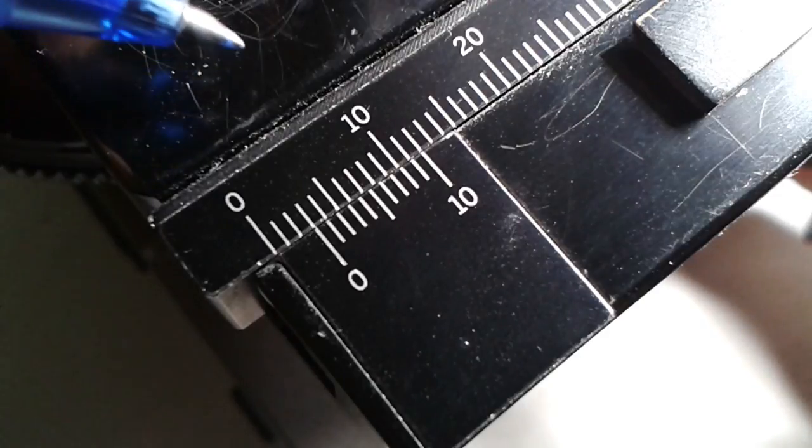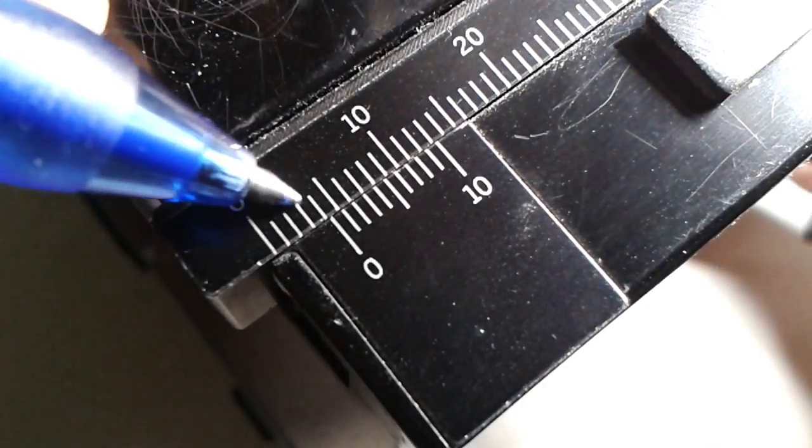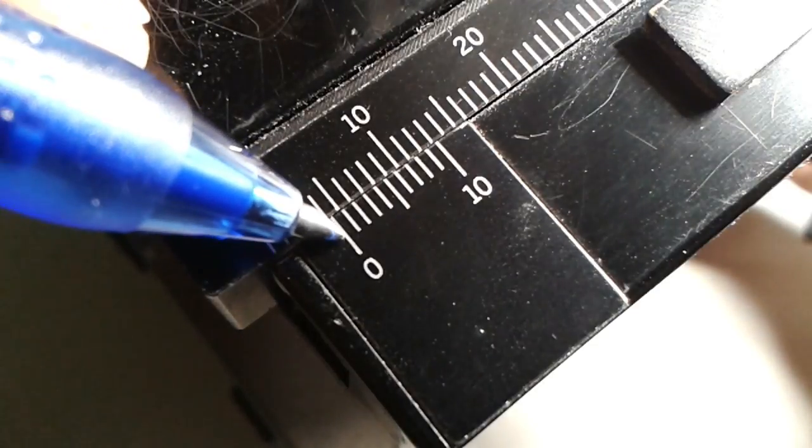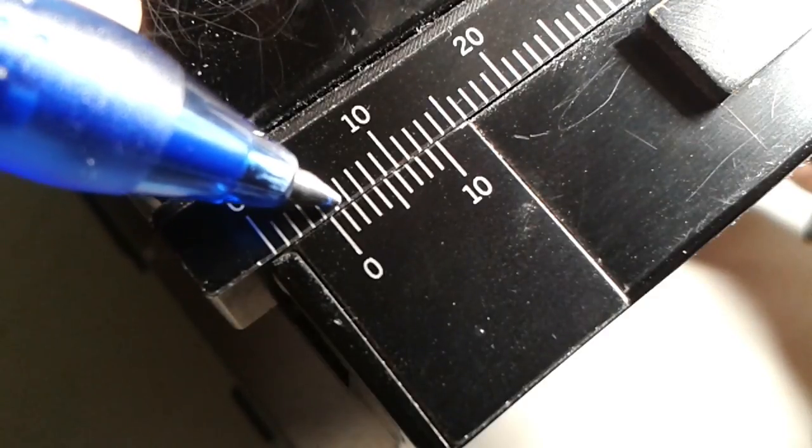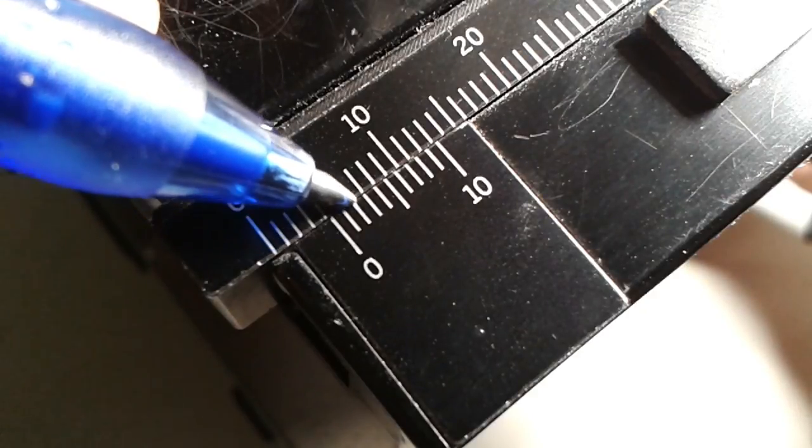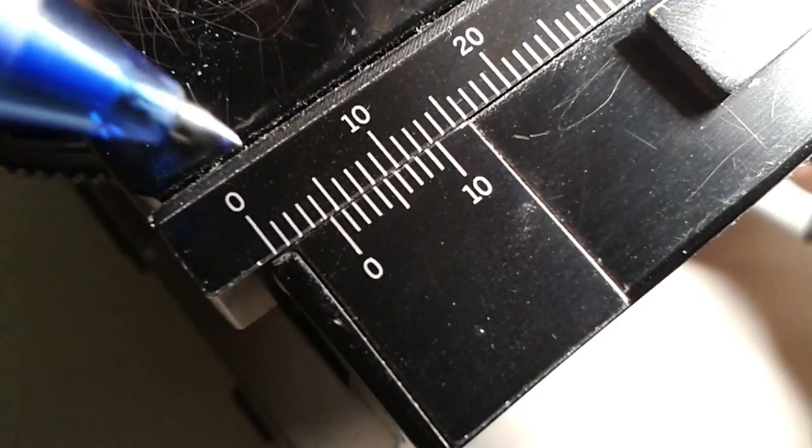So let's try another one here. For example, this is one, two, three, four millimeters and a little bit. What could this be, maybe 4.1, 4.2? Let's look which one is lined up. I think maybe the second one is pretty much lined up or the third one. So this would be 4.2, the 4.2 millimeters.